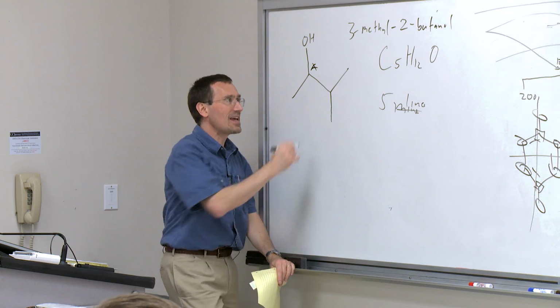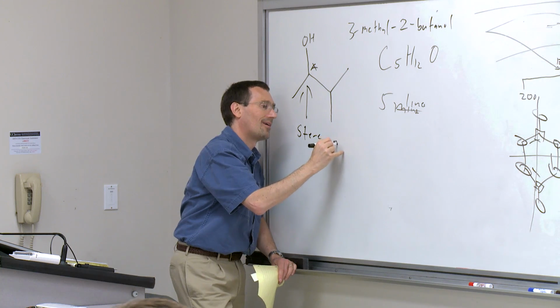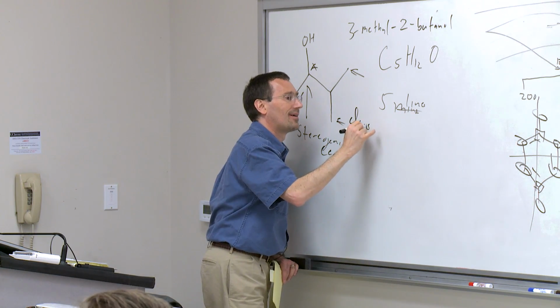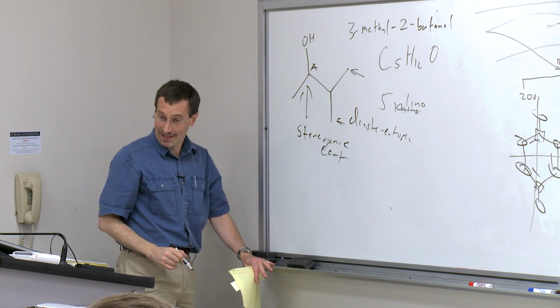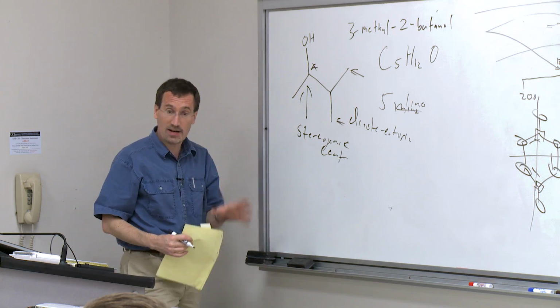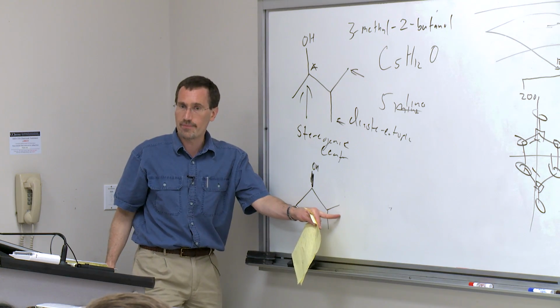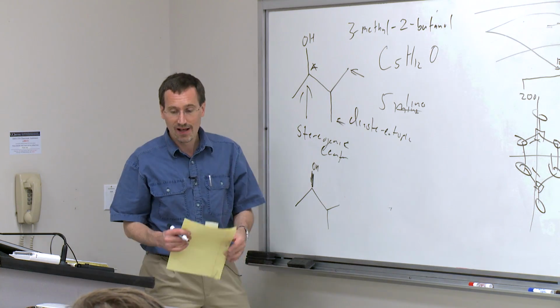This is a stereocenter, even though I've drawn it in flatlands. And so the 2 methyls are diastereotopic. In other words, this molecule consists of enantiomers. Well, doesn't matter, but even if I had a pure enantiomer, even if I just had 1 enantiomer, I would have diastereotopic methyls. And so it's 5 lines in the NMR spectrum.